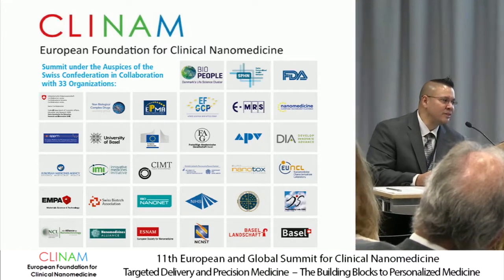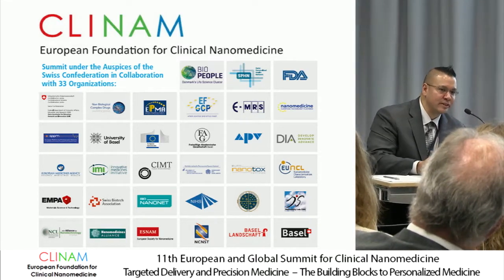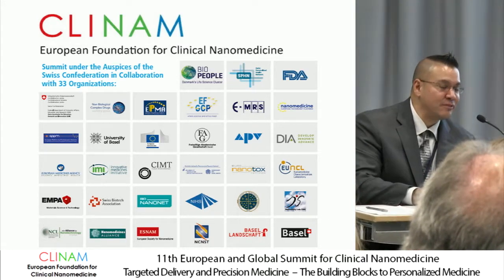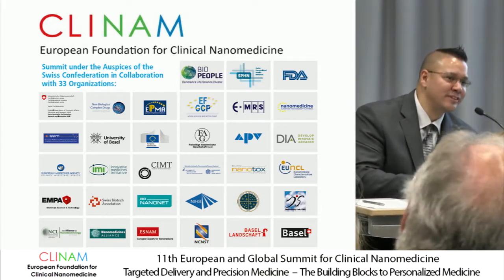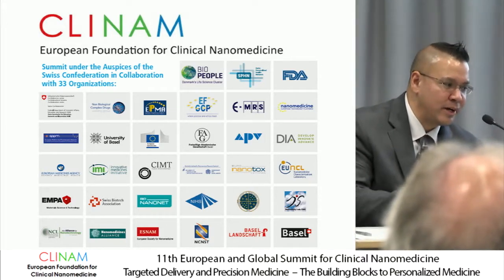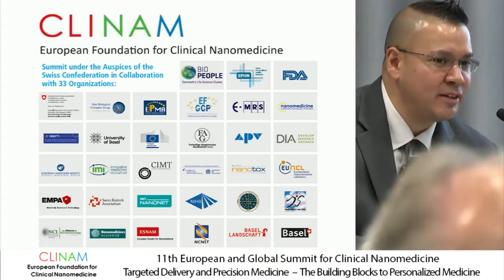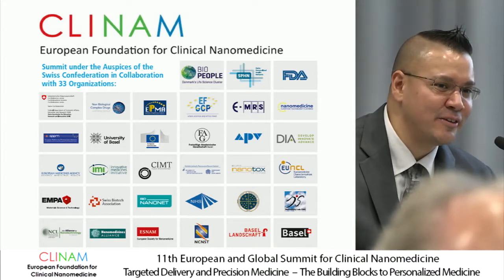So the ideal really, though, is to define your CQA. You need to link that to a biological outcome. So if you have a sample, let's say you have 3 batches that have sizes 10, 12, and 15. Now, does that really mean they're different in terms of biological situation? It may not be, right? In which case, then, who cares what sizing you do, right? It doesn't matter what technique, right?